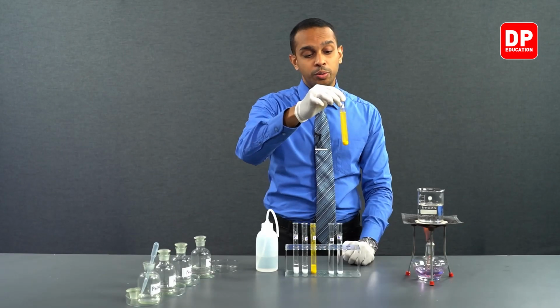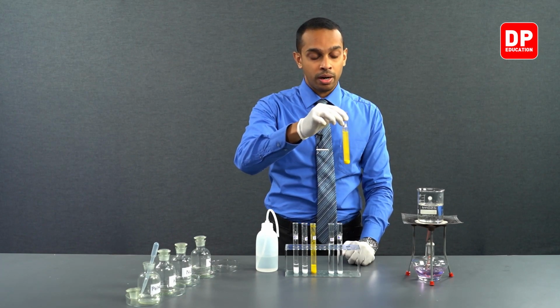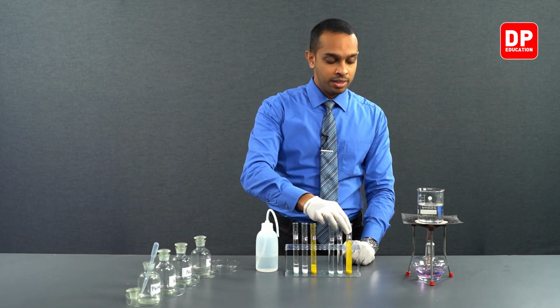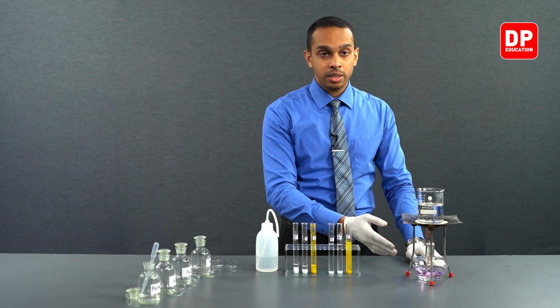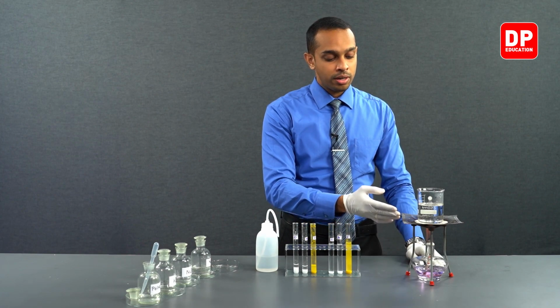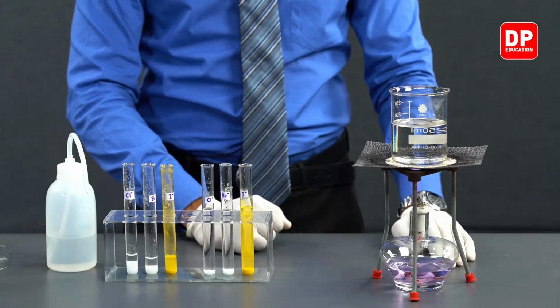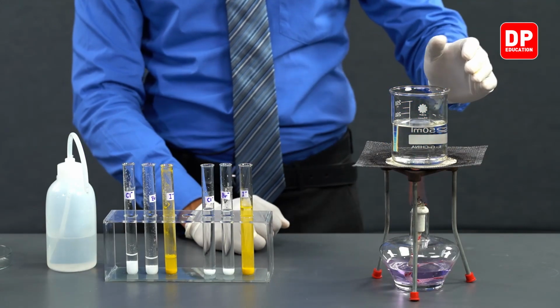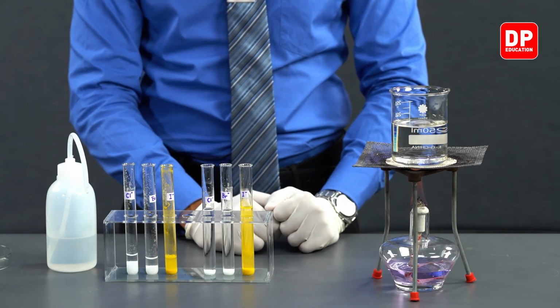Now, what we are going to do is, we will be adding all of these into a water bath. What you see over here is a water bath. You can see a spirit burner set up with a tripod and wire mesh and a beaker full of water. So we will be heating this water bath with the use of our spirit burner.